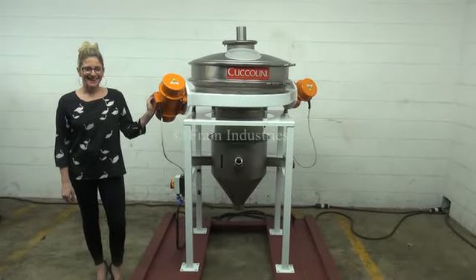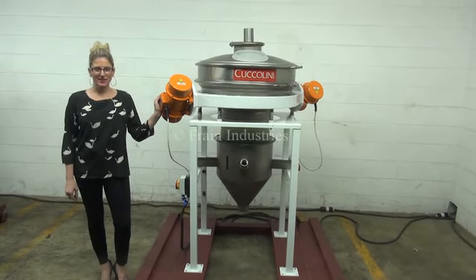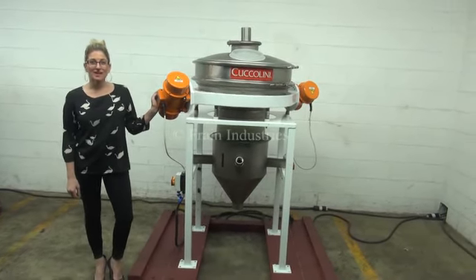Hi, I'm Katie with Frain Group. Today we're cycling a Cuccolini vibratory sifter. The voltage is currently set to three phase 240 volts.